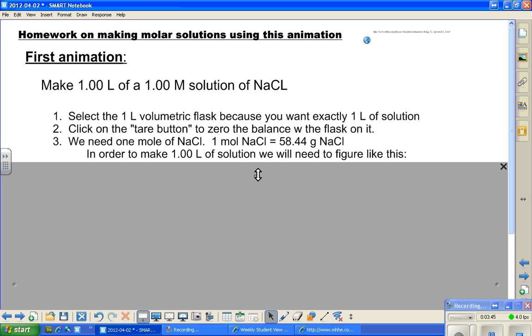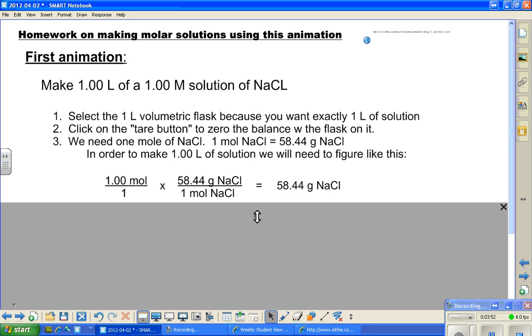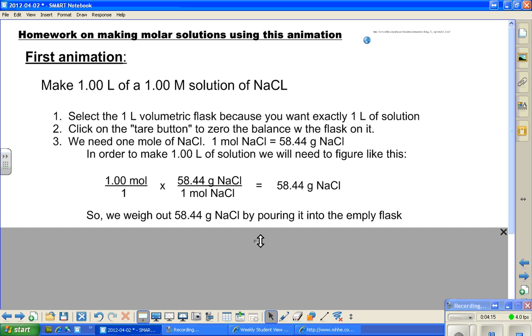In order to make the one liter of solution, we'll need to figure it like this, and I want to see this calculation. We have 1.00 mol / 1 times 58.44 g NaCl / 1 mol NaCl equals 58.44 g NaCl. So, we weigh that out by simply pouring it into the empty flask, which, by the way, must be dry. Because if we put a little bit too much in, we can't get it out if it's wet, because it will be stuck to the insides. Dry is the name of the game with this guy.